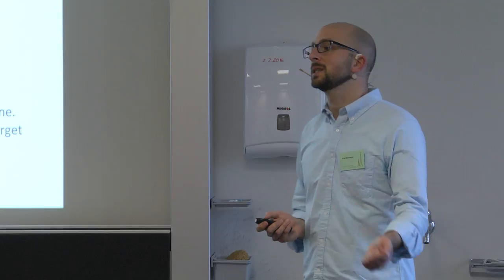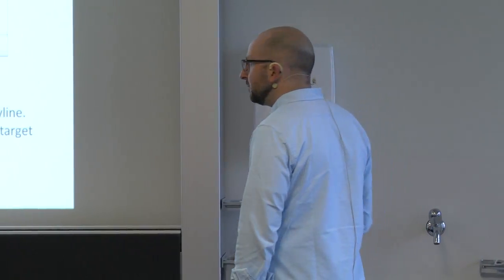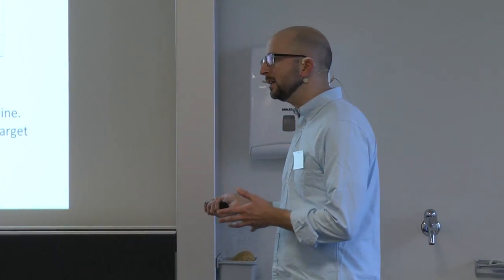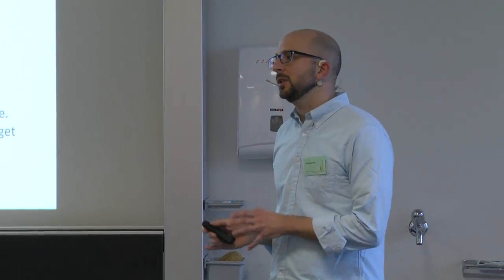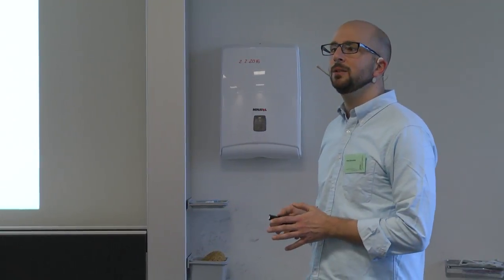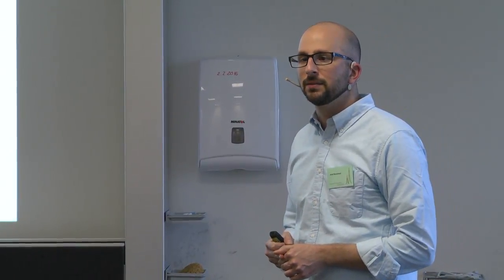So you're going to go to Excel and try to actually generate this linear fit and see what you get as IRT values. Once we move from this measured time to the IRT index, the IRT value, you'll do it with Skyline such that you've set up an IRT calculator in your Skyline document, and you can always do these predictions. Are there any questions till now about IRT, about using retention times or anything like this?